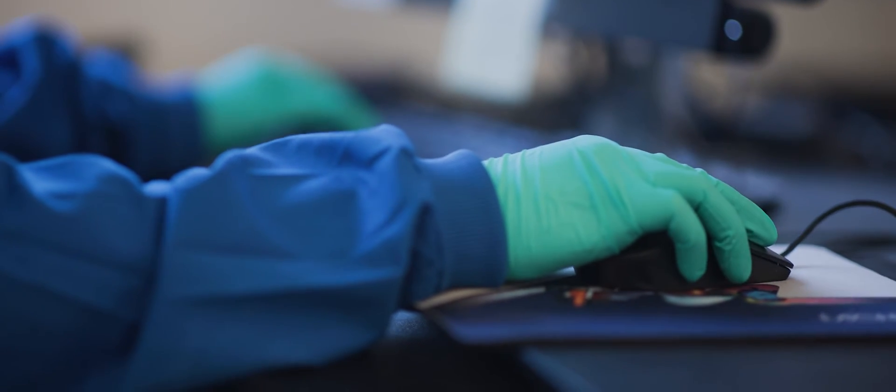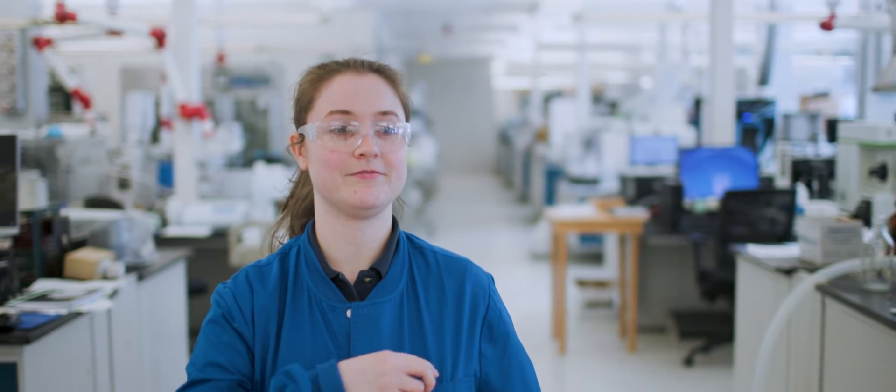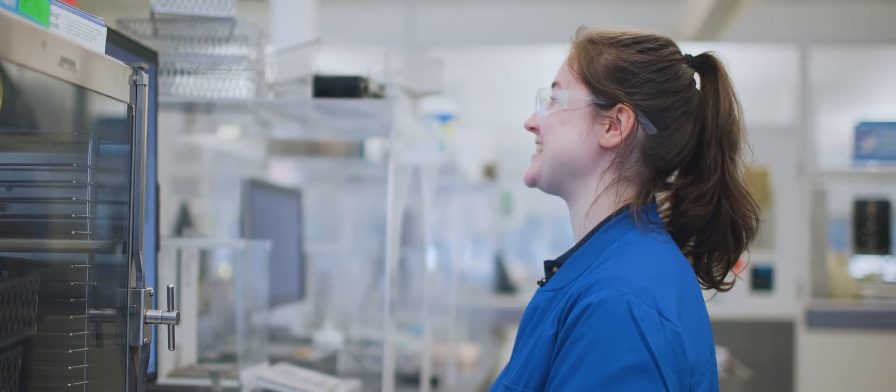Right as Kimberly graduated, a laboratory analyst position opened up. She applied, interviewed, and with three years of experience already under her lab coat, she landed the job. It's never boring here.